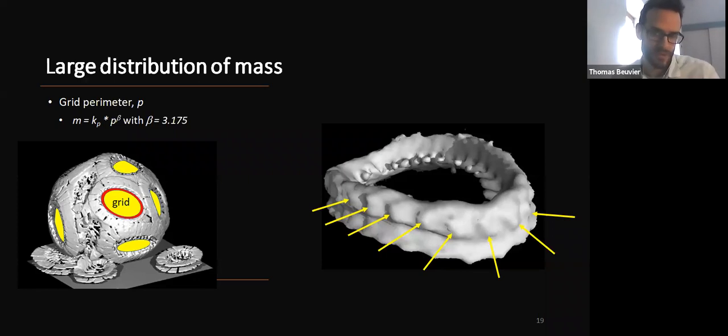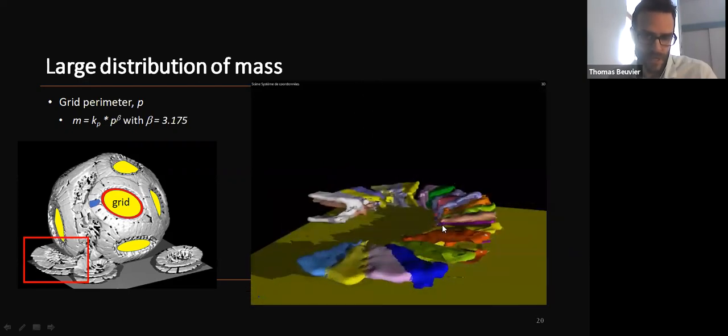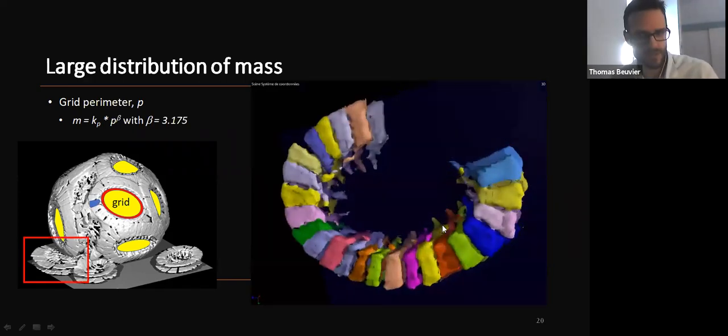These monocrystals are called segments. It's not very easy to segment each monocrystal because the resolution is slightly too low, but it is very simple to count how many segments there are for each coccolith.